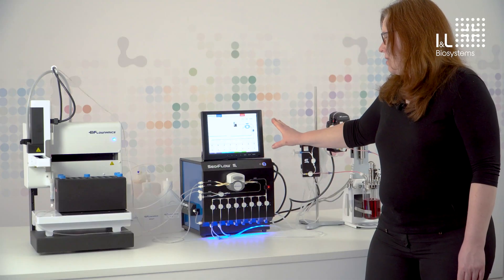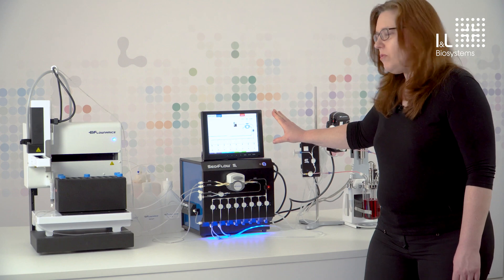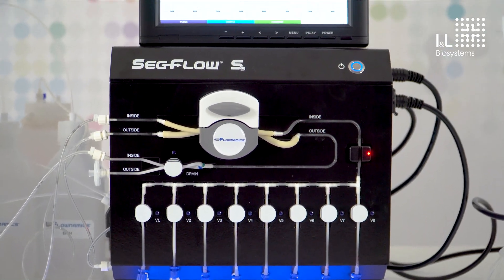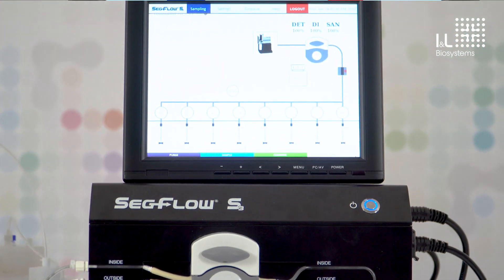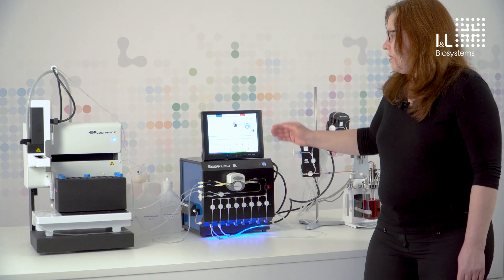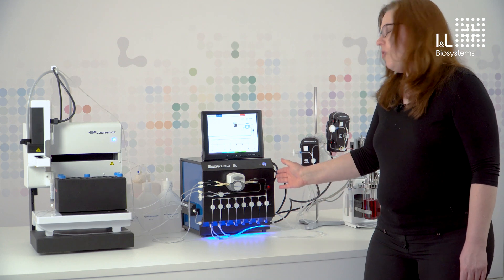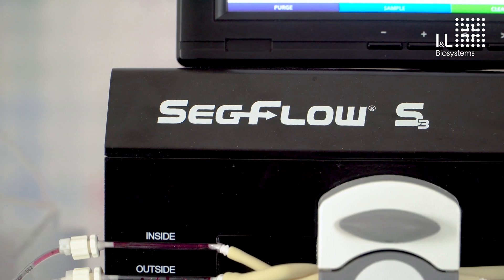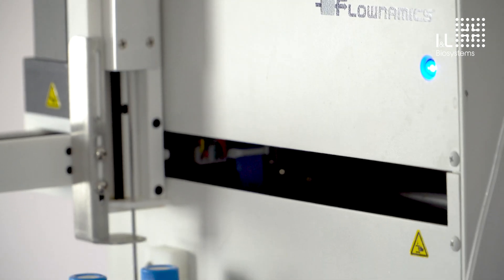The software in the SecFlow is very user-intuitive. What is shown here can also be seen on the screen: the sample tube, the sensor, the pump, and the sampler. The software is designed to ensure an optimal sampling procedure. The sample that runs out of the SecFlow goes to the Flow Fraction 400 collection station.